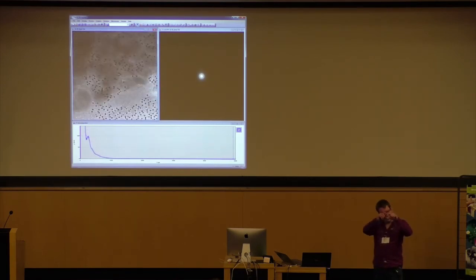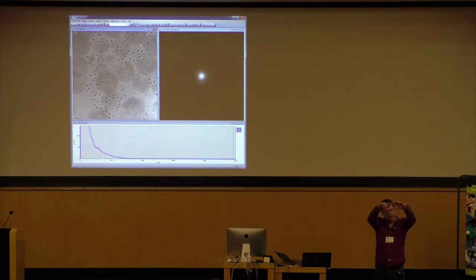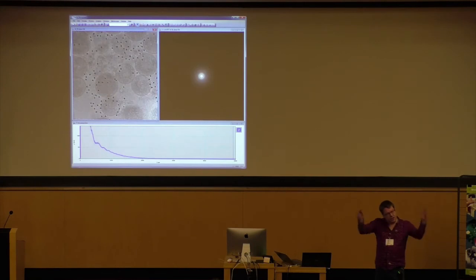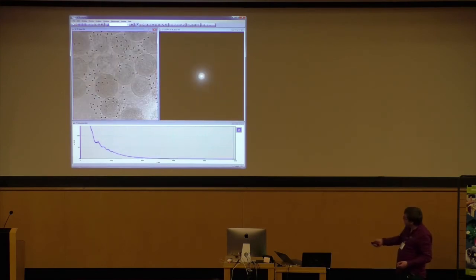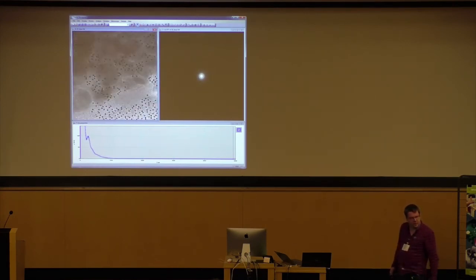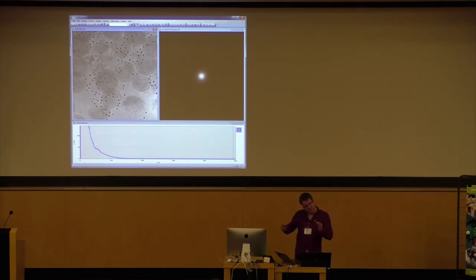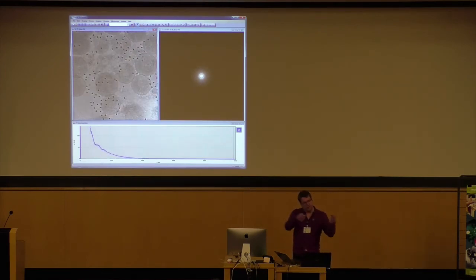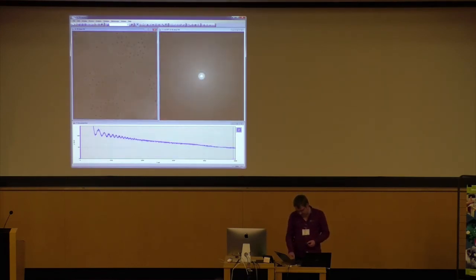Subtomogram averaging really means in the middle you have a couple of Fourier slices with high resolution information, and everything around it is low resolution alignment information. There's no resolution in this whole space. So this dose filtering is so heavy where I then say, okay, I'm losing so much here, I probably don't care about a pixel drift there because I'm filtering so heavily anyway. And that I think is where we can still save time by coupling these things back and saying, how conservative do I need to be compared to how much we dose filter anyway when we process this stuff.